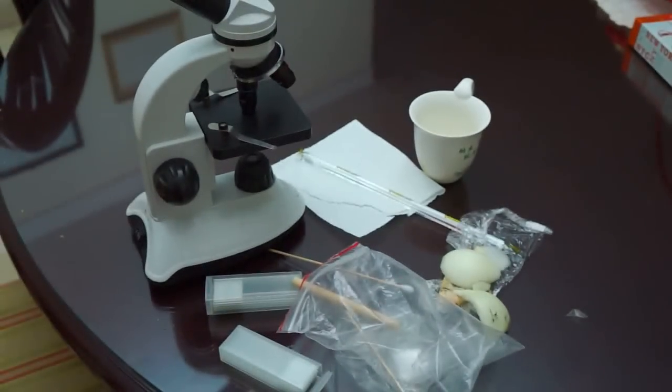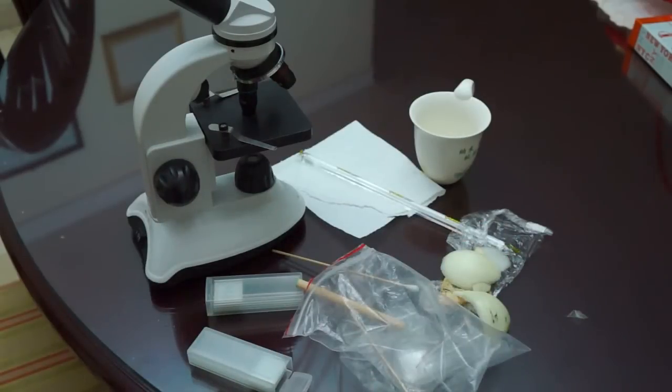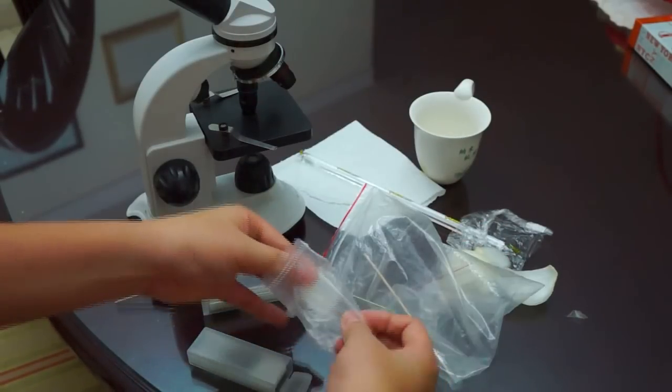Now we are going to prepare a slide. We are going to use our slide, cover slip, put what we just took out from the onion epidermis and add some water, prepare it and put it in the microscope. I am going to take my glove out now. I have my glove just not to have stinky hands. So we take our slide and prepare it.